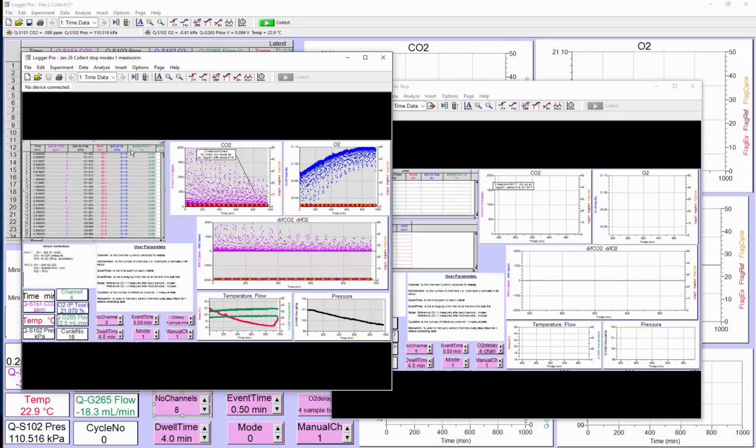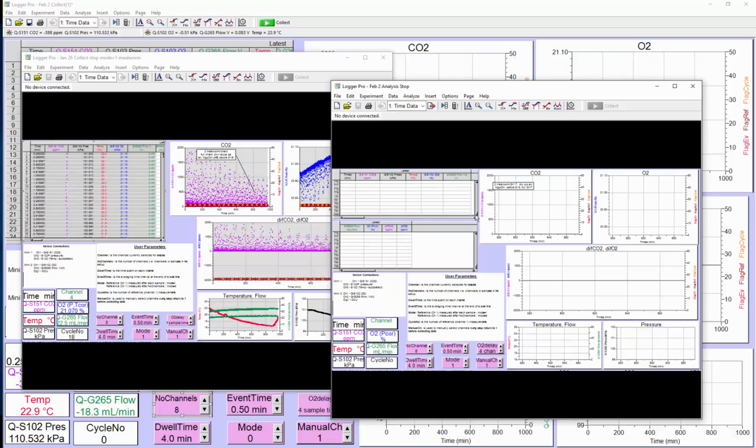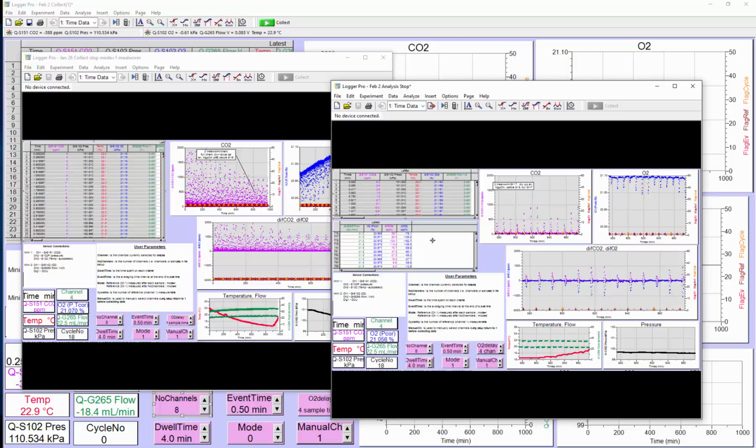So we have those all. Right click and copy, and come over to the empty analysis file and deposit them in the first row of the time column. So select that cell, right click, and paste. And now all that data will be deposited in these channels, and the calculations will be immediately done. The graphs will be populated and all the sorting done.